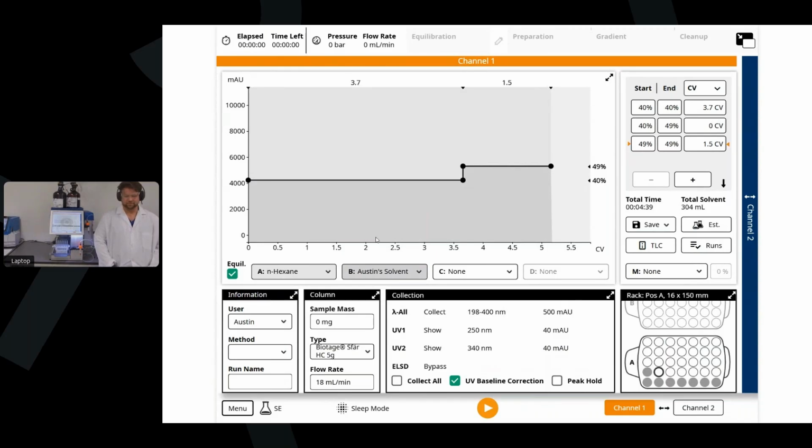Your next question is, are there regular software updates for the instrument? And if our system is not possibly to be connected to a network, how can we do these updates? Yeah, so software updates can be added via a USB. I don't think we do those by network anyway. So you can get that software either from your service engineer or contacting our one point support team. But yes, we're making regular updates, especially as we add new features, new capabilities, and if you guys are experiencing bugs, we try to fix those as soon as possible. But those are simply added via USB. So you don't need a network connection for that.